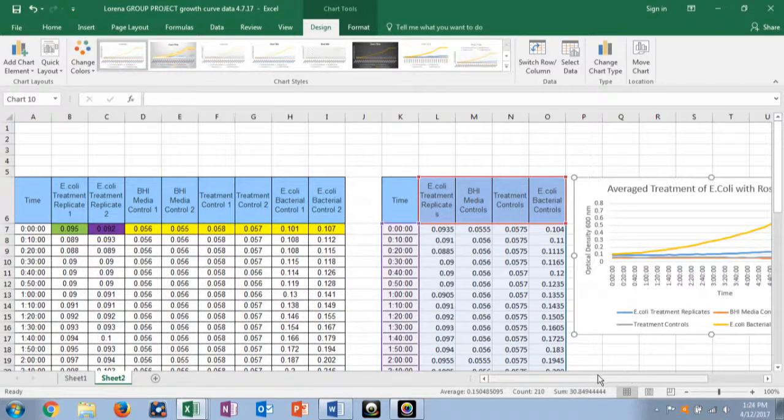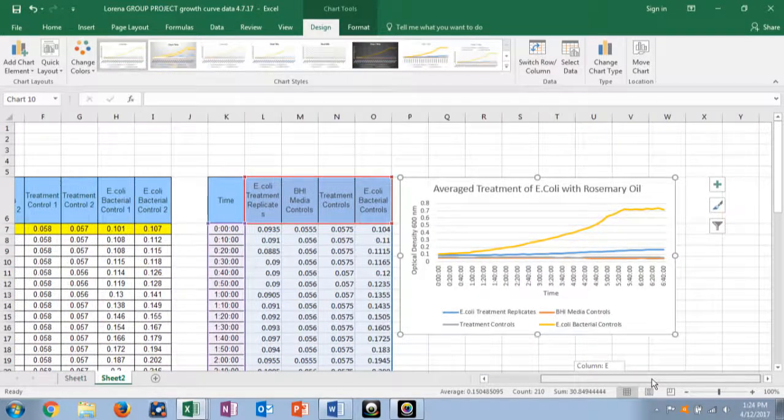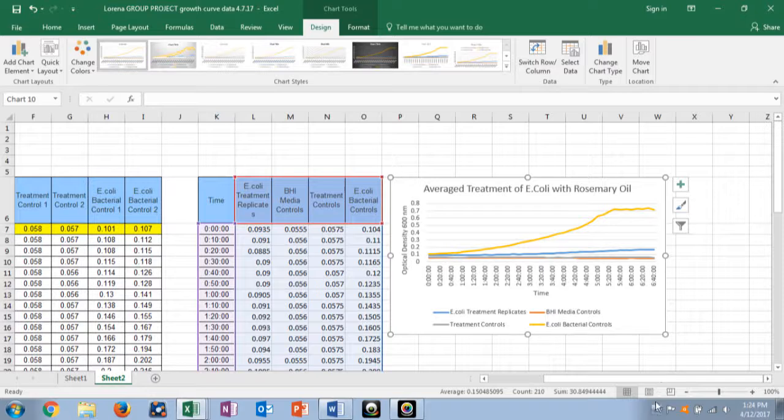Remember, it's in the log phase with that, not the growth rate, the generation time, the GT equation. That was a big issue. It's not growth rate, it's generation time. Growth rate is different. It's in the log phase, so it's like where it's exponential, like around here, of your organism, and then try to calculate how it changes. So like from around the same time point, even though this doesn't really have a log phase. Just choose 2 time points and try to see how the generation time changes. And I would include that in a chart form, the changes in generation time.